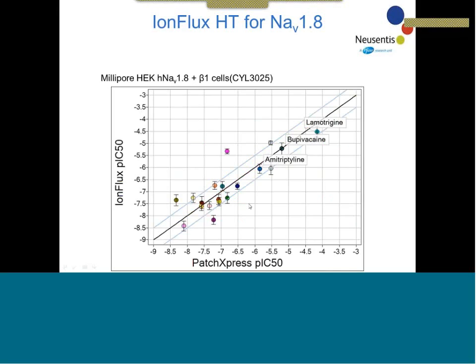And then correlating to the PatchXpress, it's the same compounds as above, and I hope you can agree with me that the correlation overall is pretty good. The potency of some of the compounds which don't completely wash out, for instance, the Abbott compound, they are somewhat off the line. And also the other aspect is that the experiment here on the PatchXpress was using steady state detection for compounds, so the compounds were applied for a longer period of time, whereas we have a fixed limit to the time that each concentration is applied, and therefore we might underestimate the potency. But I would say the correlation overall is pretty good.